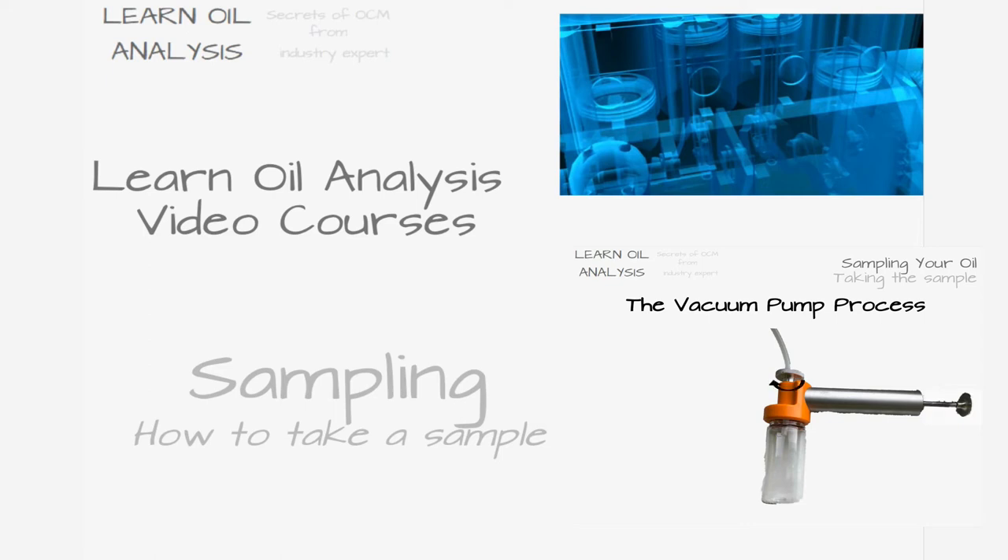Hello and welcome to this Learn Oil Analysis video on how to take oil samples. In a few short minutes you'll have a good grounding in how to take samples from your machinery safely and correctly so you get the most benefit from the oil sampling program.